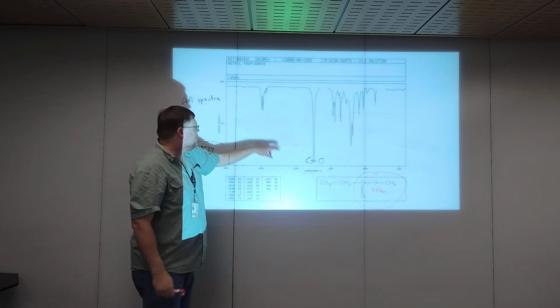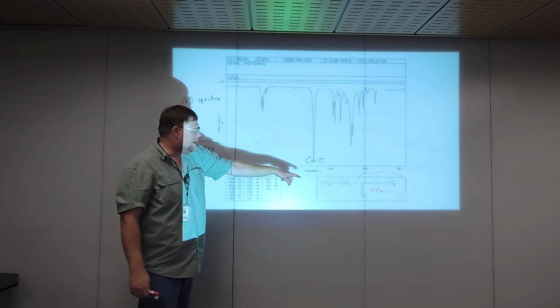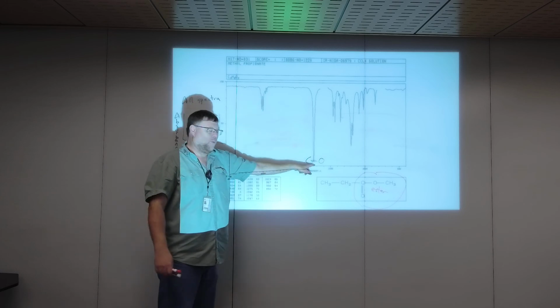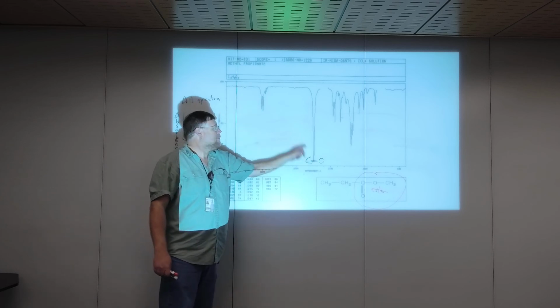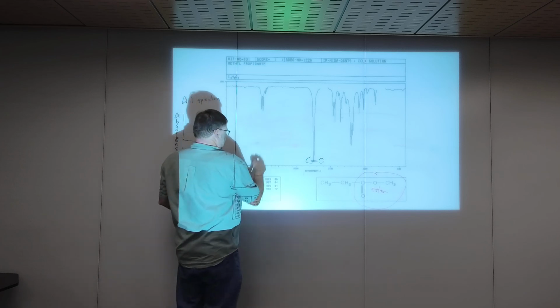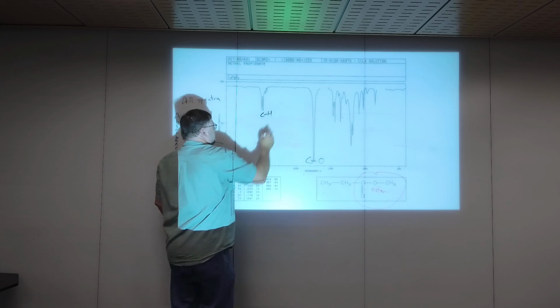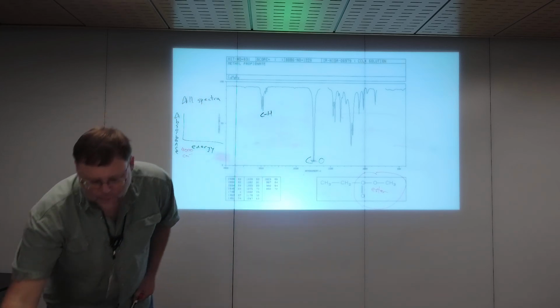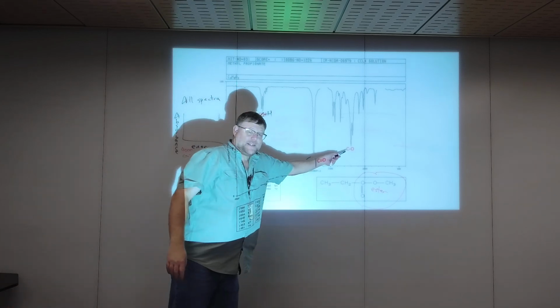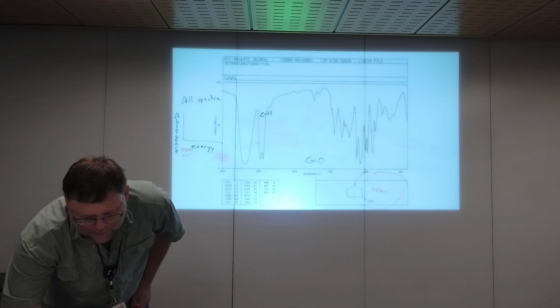All right. This molecule does have CHs. Now you see how weak the CHs really are. We have one carbonyl. We have 8 CHs. Here's our 8 CHs. There's the one carbonyl. Massive difference in absorbance. And if you took this straight up, 3,000 hits right there. So they're all sp3 CHs. And I've put this, that is a CO single bond. Don't worry about it. You don't need to use that or know about it.